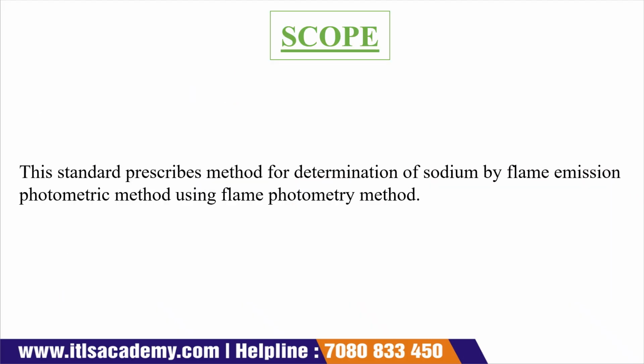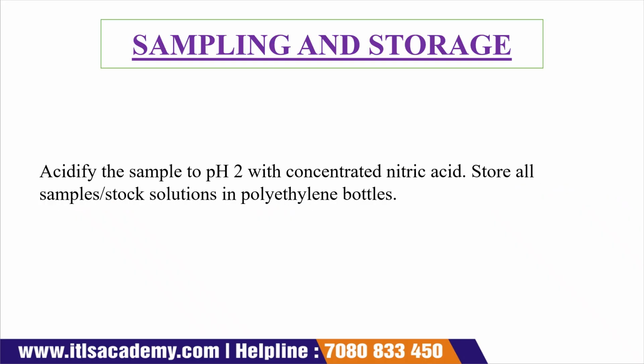Now, scope. The standard prescribes a method for the determination of sodium by flame emission photometric method using flame photometry. So the method that we are going to use is the flame emission photometric method. This is the scope of this experiment. Now come to the next slide, that is sampling and storage.